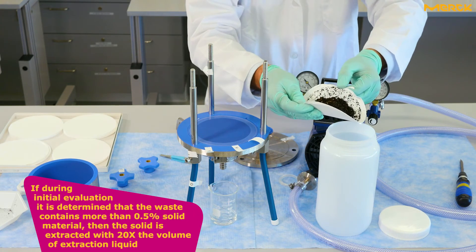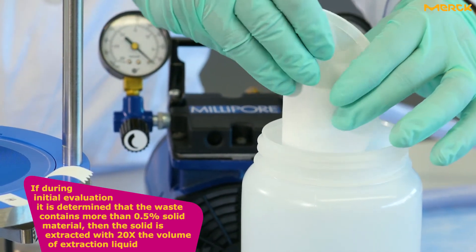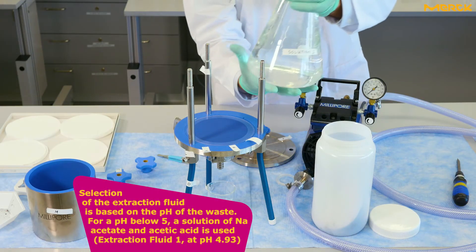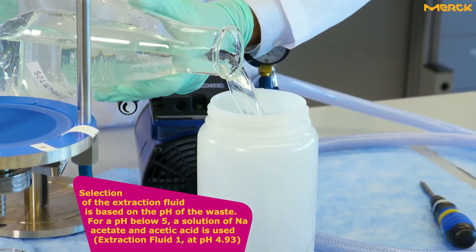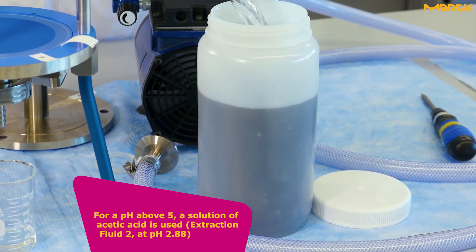If during initial evaluation it is determined that the waste contains more than 0.5% solid material, then the solid is extracted with 20 times the volume of extraction liquid. Selection of the extraction fluid is based on the pH of the waste. For a pH below 5, a solution of sodium acetate and acetic acid is used. For a pH above 5, a solution of acetic acid is used.